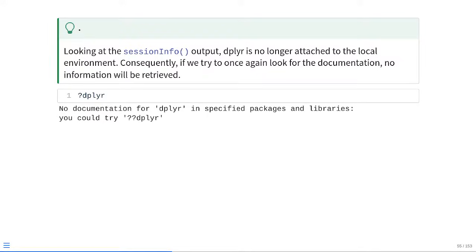So remember, you can install your R packages, but then once you have them installed and you're about to work with them, you need to actually load them, attach them into your environment using the library command so that you're able to use the functions within. And this is what I didn't know back in 2021. And if I had been able to troubleshoot that, I probably would have had an RNA-seq analysis done in a few months at that stage.